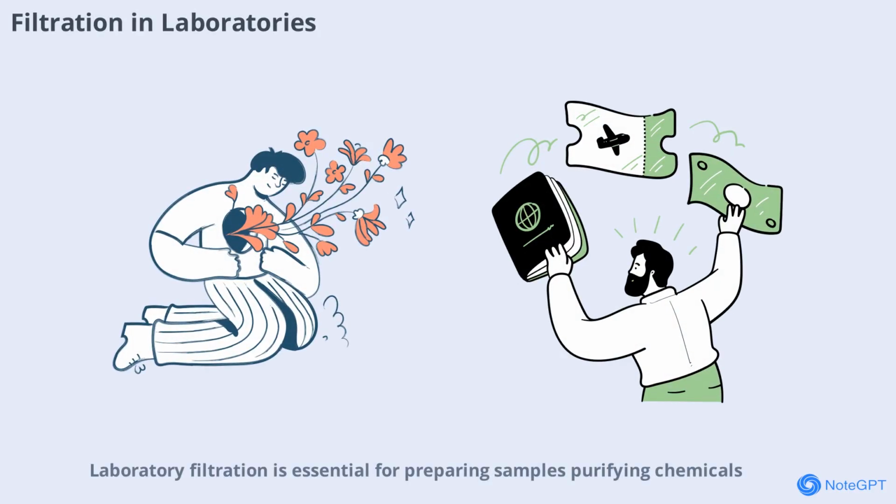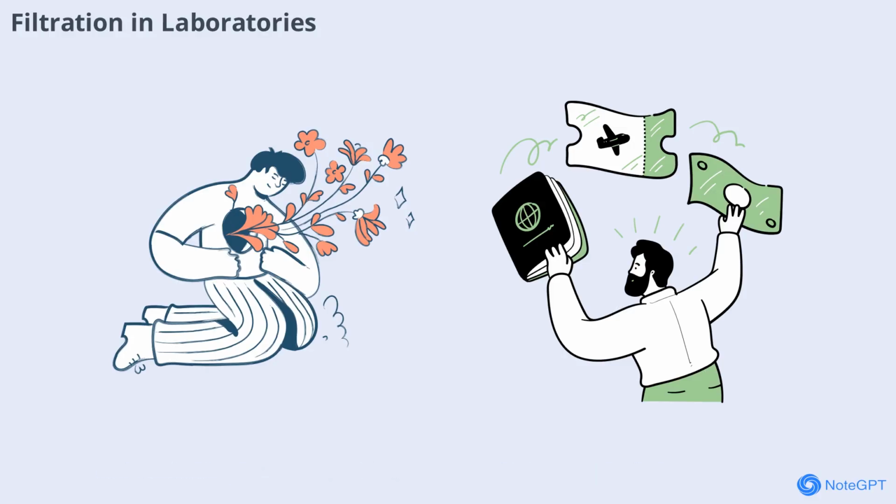Laboratory filtration is essential for preparing samples, purifying chemicals, and conducting experiments. Different types of filters and techniques are used depending on the task at hand. Mastery of filtration methods is a fundamental skill for any laboratory technician or scientist.